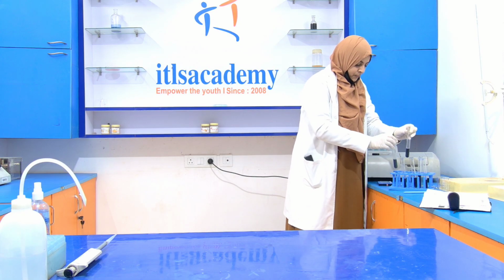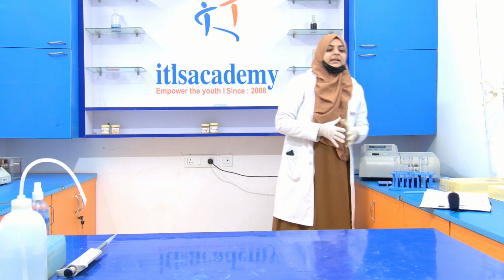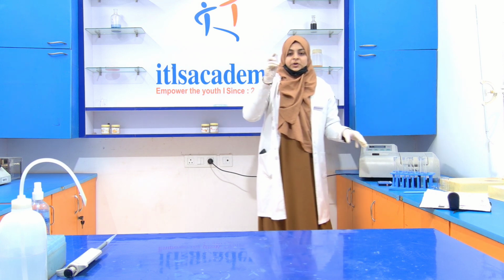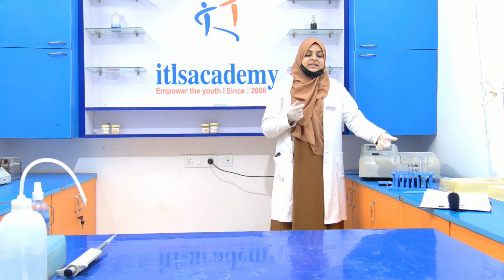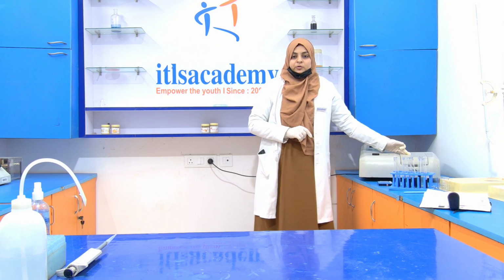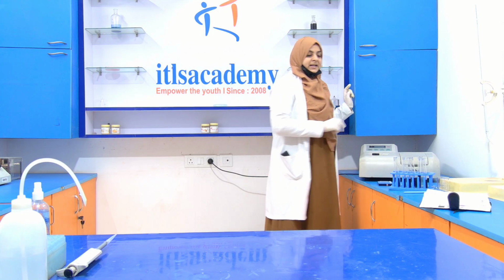Now, we have to take the absorbance with the help of the spectrophotometer, and this is your cuvette. We simply transfer this solution into the cuvette, put the cuvette inside the spectrophotometer, and see the reading on the display.